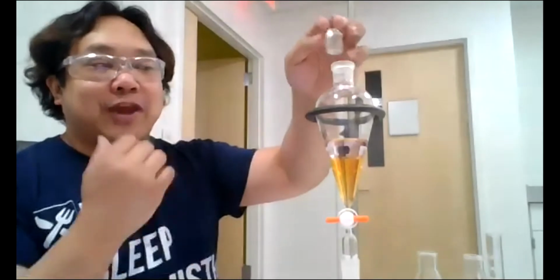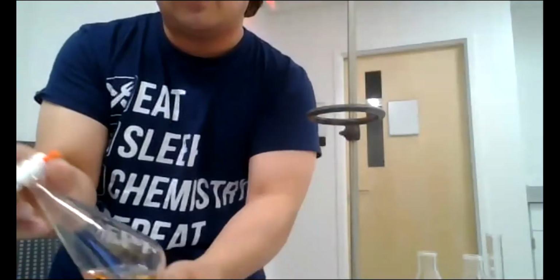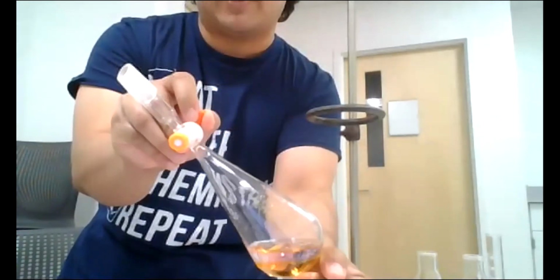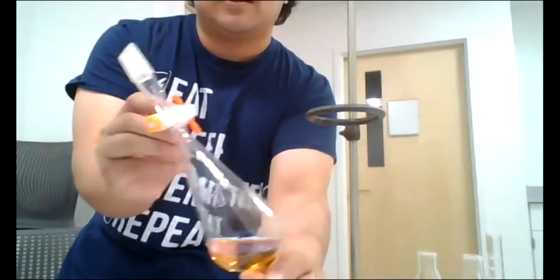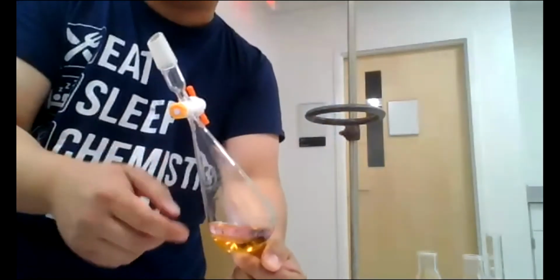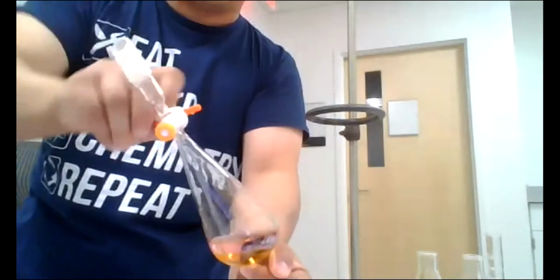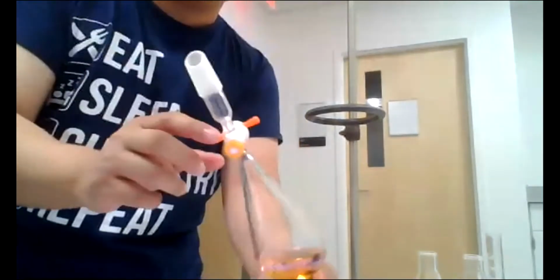Keep it always unstoppered. I'm pretty afraid of gas production, though I don't think a lot of gas will be produced, but a good habit is in your first shake, you stopper it. You take it out of the ring clamp, you invert it, and then you release any gas, like this. So now it's open. Before any shaking, when you invert it, go ahead and release any excess gas, just in case gas is being made. And then go ahead and close the stopcock.